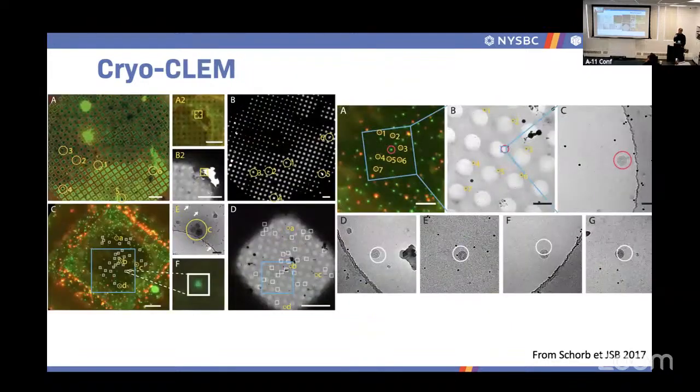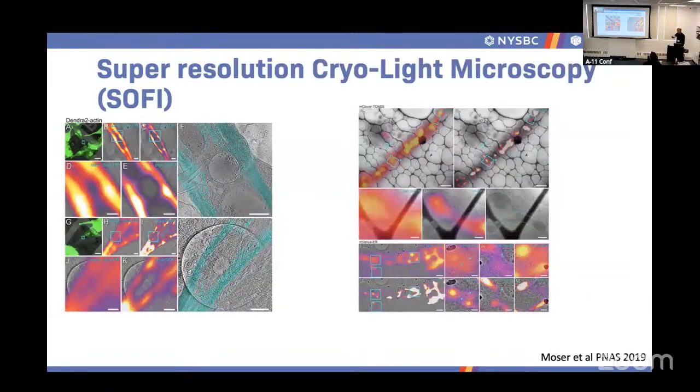And then the next thing you want to do is correlate that image that you have. Three minutes only, I'm like halfway. Okay, I'll go quick. You correlate quickly, and you'll find whatever object of interest within the slide. You can do this at higher resolution. I could have spent half an hour on super resolution, but I will not.